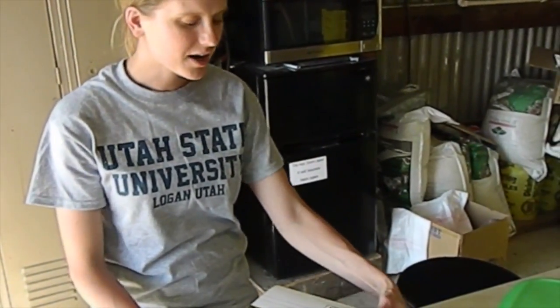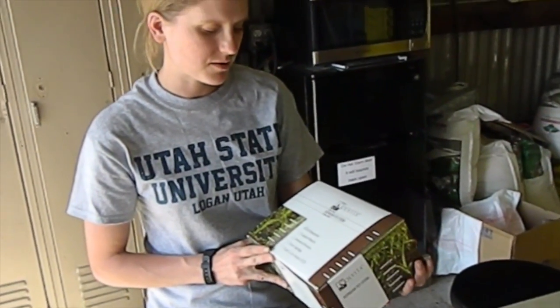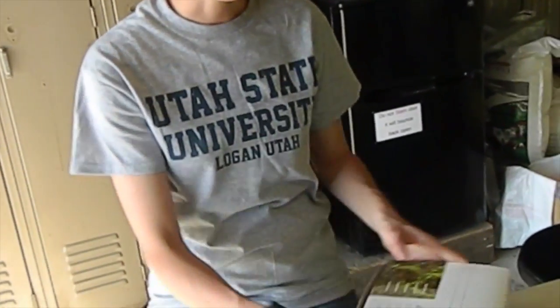Hi, Esther here at the Utah State Kaysville Research Orchard. I'm going to be going over the second part of this video series on soil biological tests. I found that Solvita soil respiration is actually the most accurate, easy test that you can do in the field.